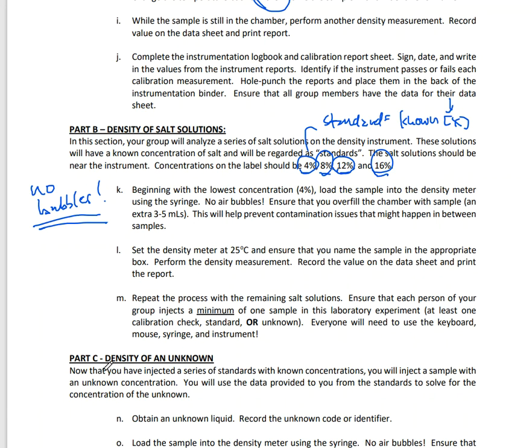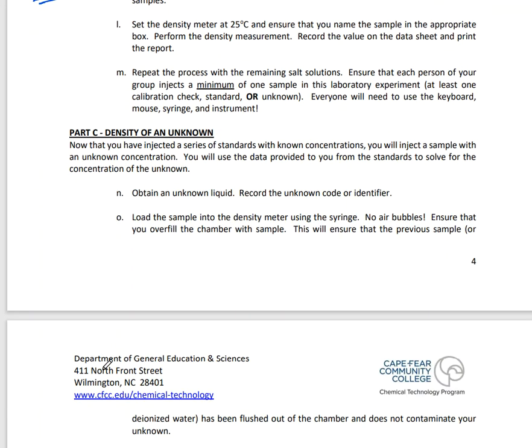And then I've got one more part left, and that's part C. And this will be an unknown. All right, so we're going to provide you a sample. This will have a percentage. You will not know that percentage. We do. We made it. We know what should be there.